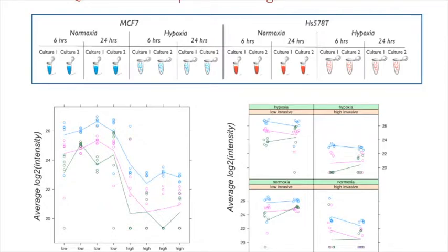And so for each cell line, you also had two oxygen treatments, normal oxygen and low oxygen. And the oxygen treatment had two durations of exposure, so 6 hours or 24 hours. And then her workflow involves some enrichment and some sample processing. So she also wanted to make sure that she accounts for the variability in these steps.